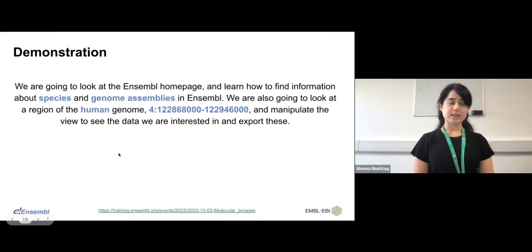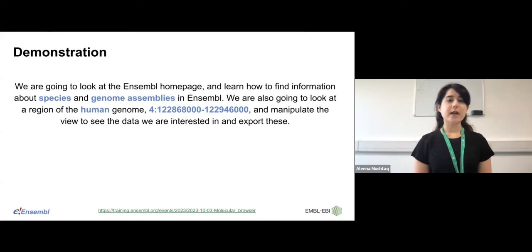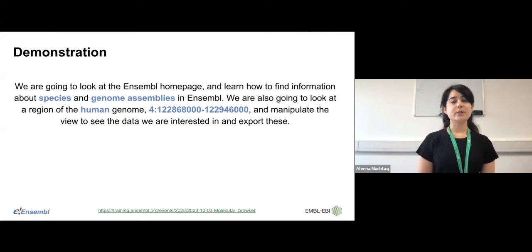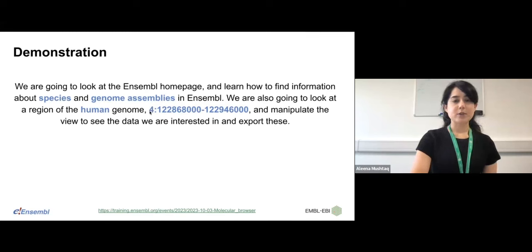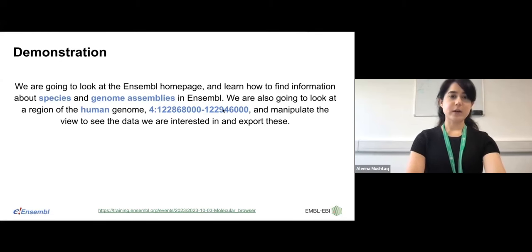I'm now going to move on to the demonstration. We are going to look at the Ensembl homepage, how you can find information about different species and genome assemblies, and then look at a specific region on the human genome — on chromosome 4. The Ensembl coordinate format uses the chromosome number followed by the start position, a hyphen, then the end position. I'll show you how you can manipulate the view to add more data that you might be interested in.